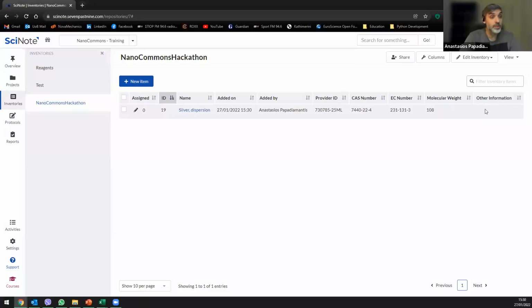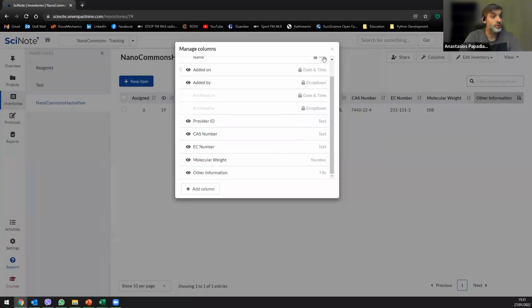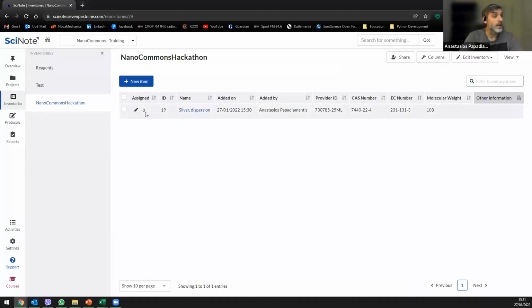And here in the other information, in many cases you want to upload something, let's say to have your MSDS file, etc. So what we want to do here is upload the MSDS file.